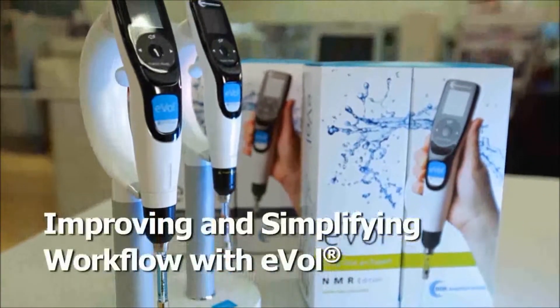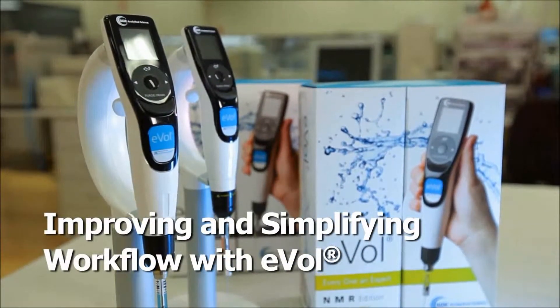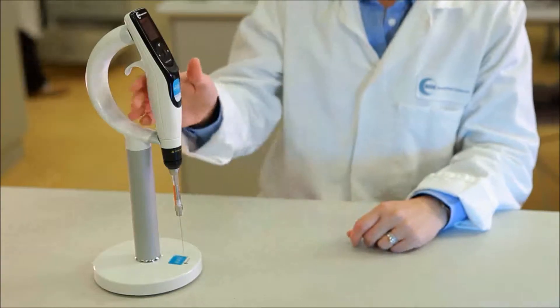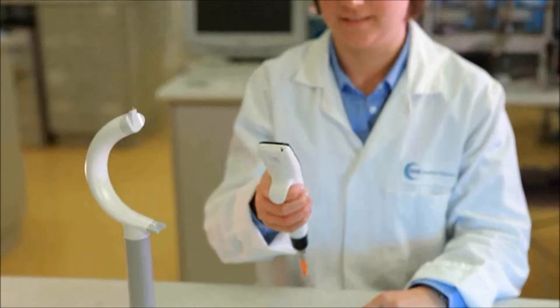EVOL gives consistent results, independent of the operator, and improves accuracy and reproducibility. The custom step-based programming mode allows for the creation and storage of multi-stepped dispensing protocols.